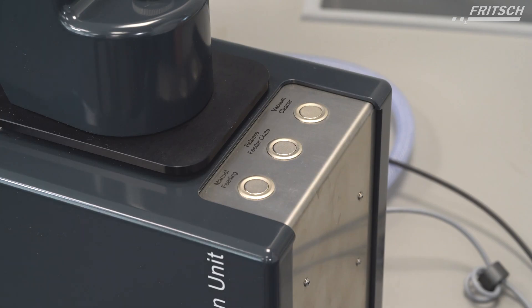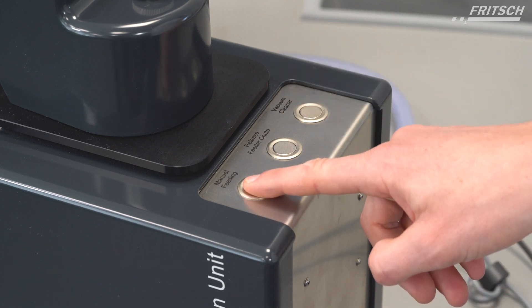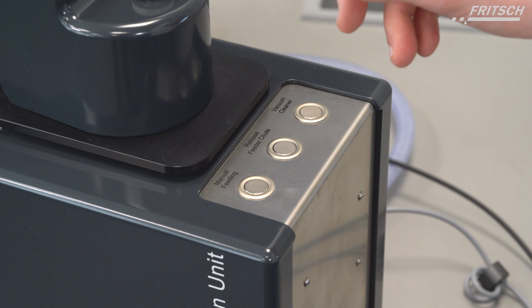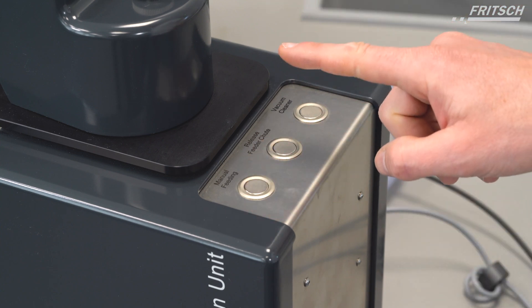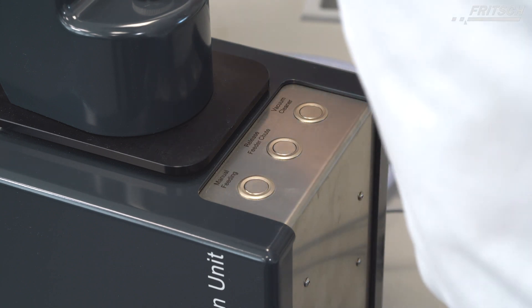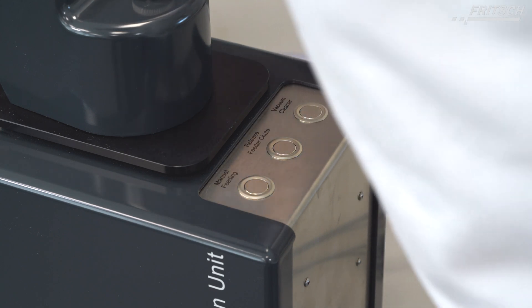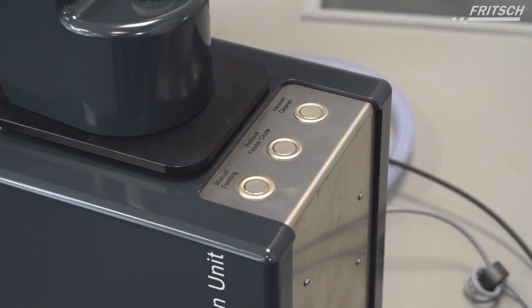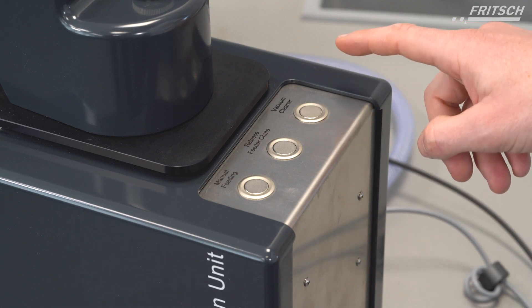On the top of the unit, you'll find three buttons. Manual feeding — press and hold it, release it for the desired power, press it again to stop. The release feeder chute does just that — releases the feeder chute — and after cleaning, fastens it again.